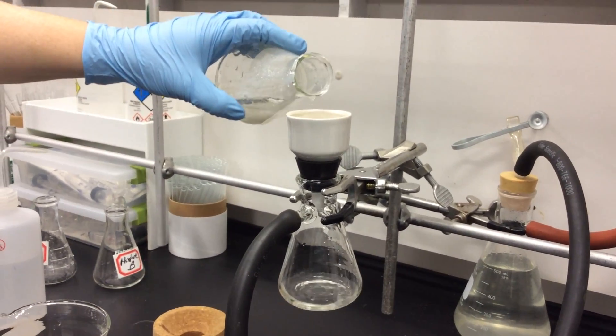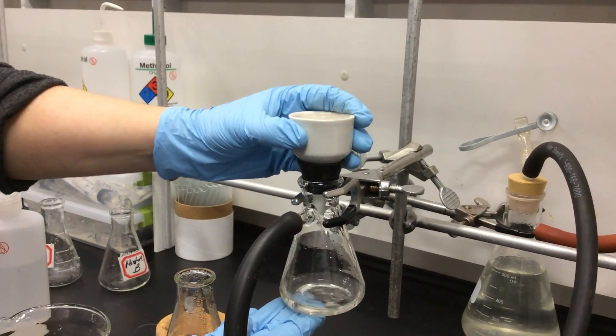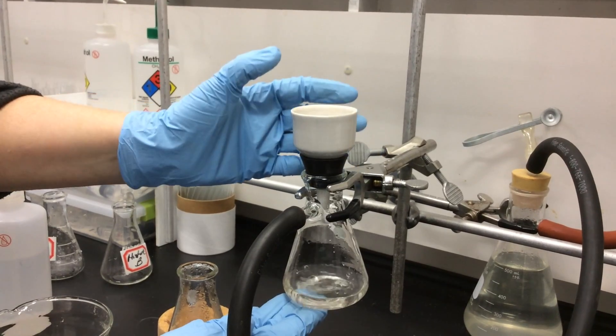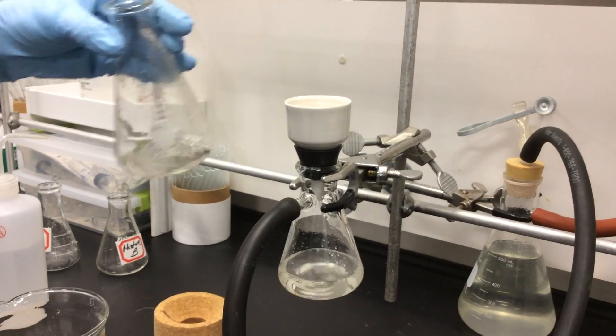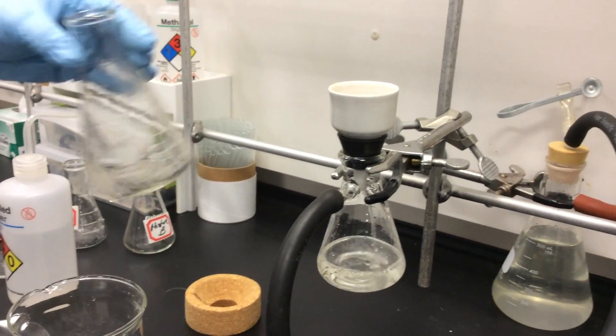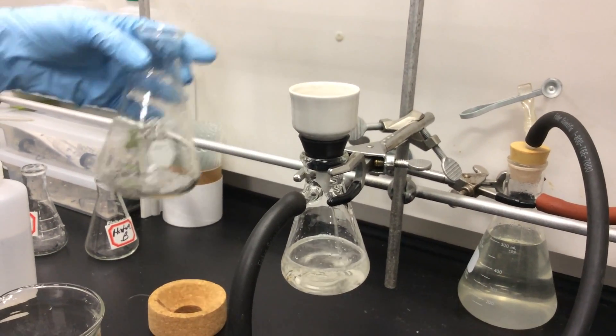Now as we're filtering, the purified crystals are being captured in the Buchner funnel, and the liquid with the impurities are going to the bottom of the filter flask. We swirl and dump, as I like to call it. We swirl the flask to get all the crystals in solution, and then we just dump it into the Buchner funnel.